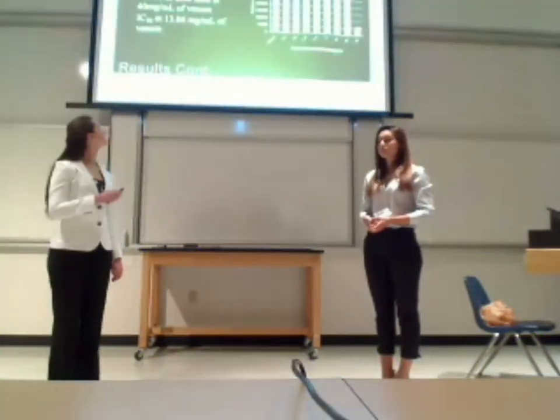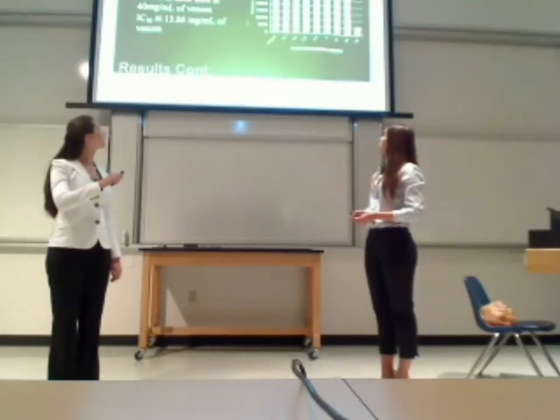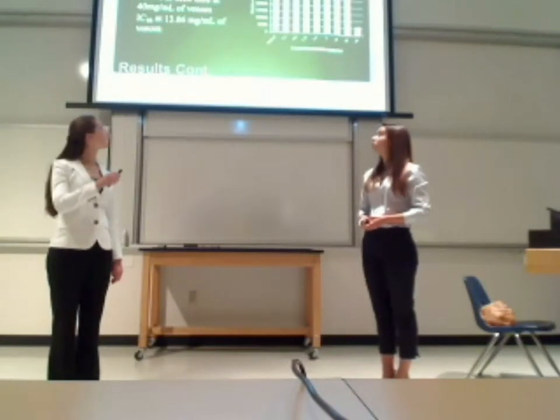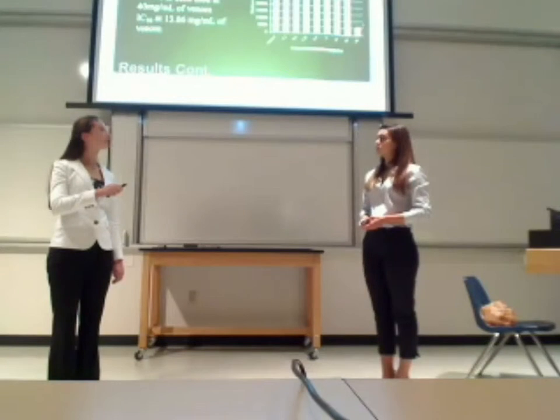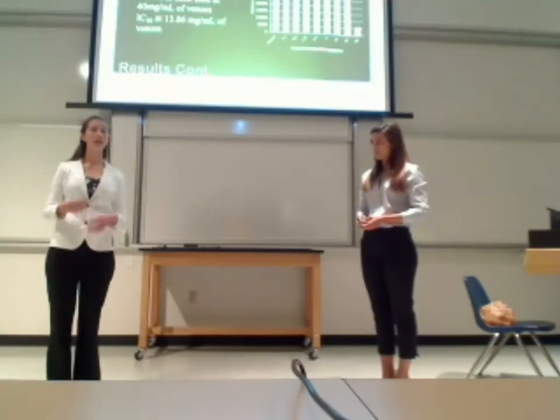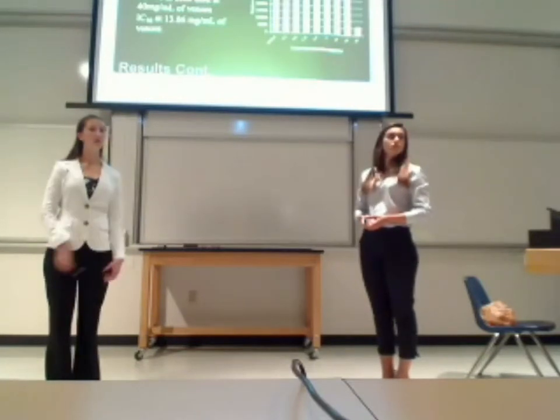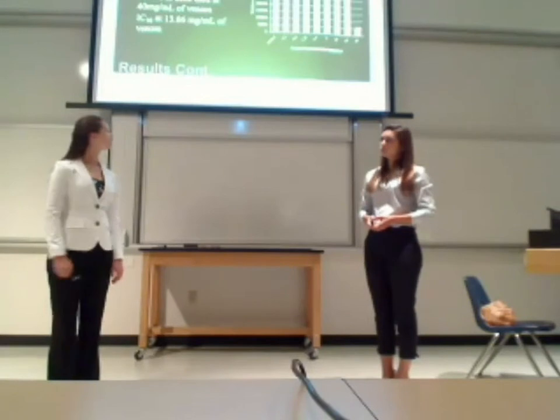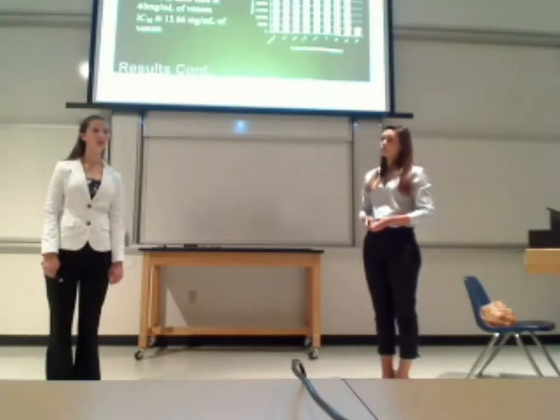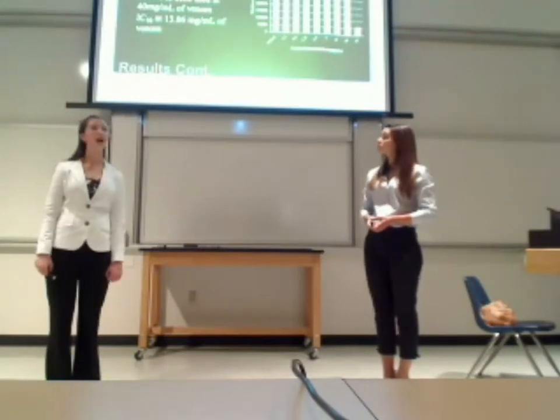And you can see that same trend here with the colon 205. Again, on the y-axis, we have the number of living cells, and on the x-axis, we have venom concentration. There's that same trend that as the venom increases, the amount of cells decreases. This cell line was a little bit harder to kill with the venom. Our IC50 number, or the amount of venom that it took to kill half the cells, was 13.86, which is a little larger, obviously, than the 10 that was found with the lung cells. Also, 98.9% of the cells died at the highest concentration.